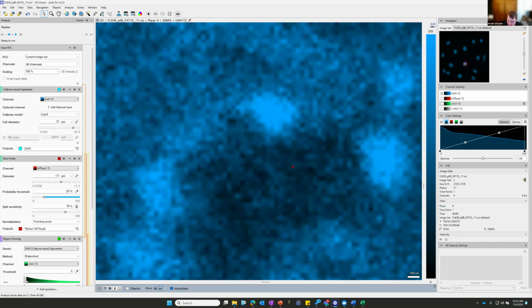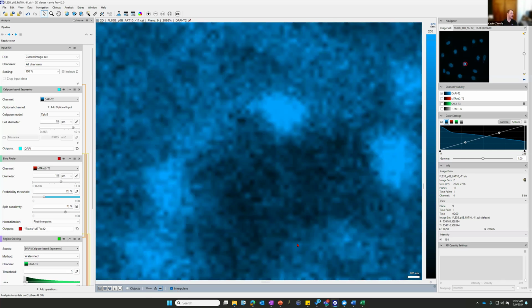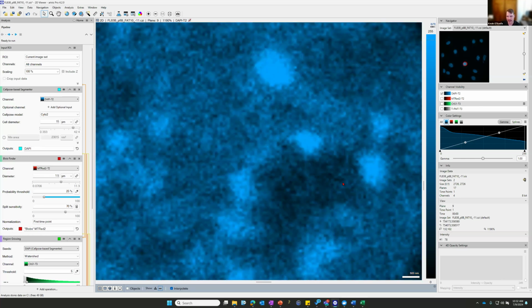And then interpolate is, I think I kind of mentioned it, but this is really just smoothing, but it's not going to adjust the data. Oh, and I want to also mention that any of this data, let's say you do some pre-processing or any sort of manipulation of the image, remember that we created a .sis file, so it's a totally separate file that's just a copy of whatever the native file you imported it from. So you're not going to overwrite your data or change any of the pixel information. Same thing with this .sis file. It's hard to change the pixel data. None of the preprocessing steps stick to the data. You can output the results and save it separately, but if you do any sort of pre-processing, once you complete your pipeline and you get your objects, it's going to revert back to the original pixel intensity information, all that raw data from before you pre-process it is going to be reverted back to the original.